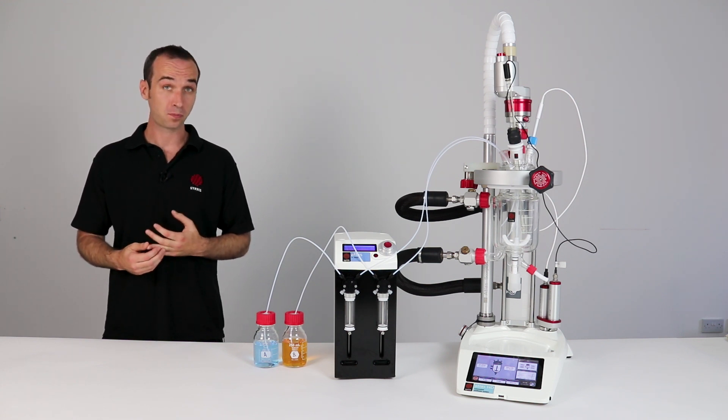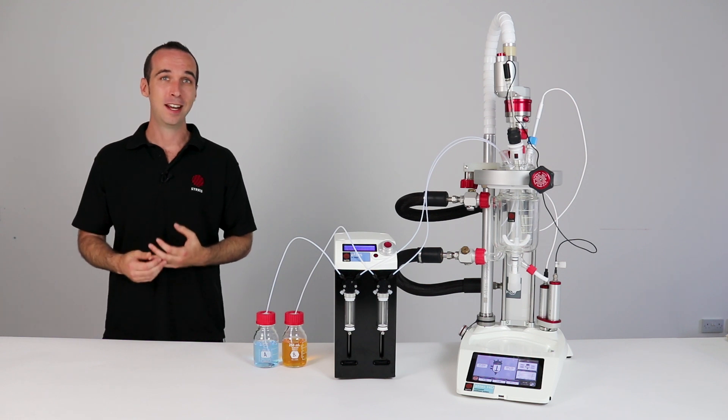Automation of time-consuming dosing procedures such as these save valuable time and can allow you to free yourself from the lab.